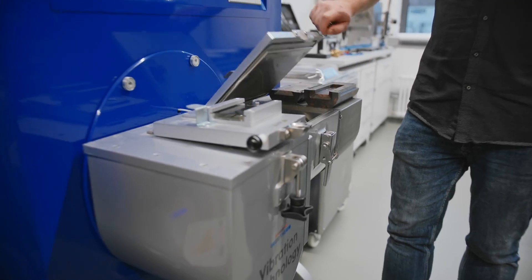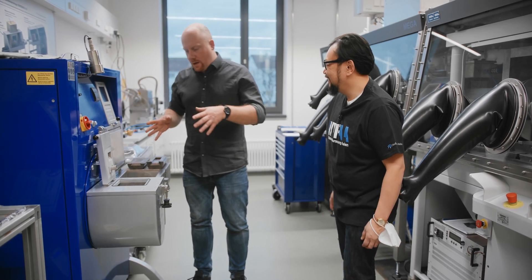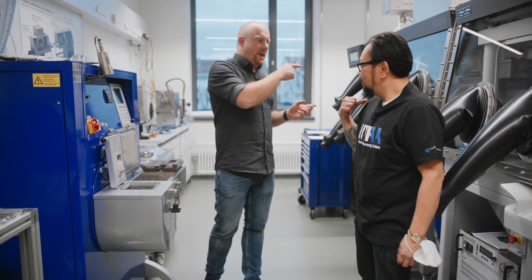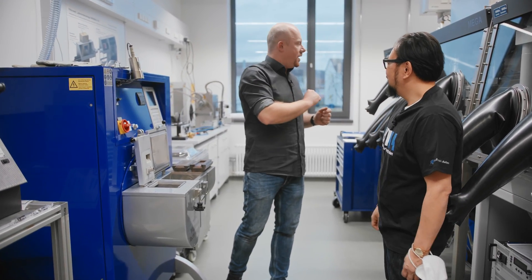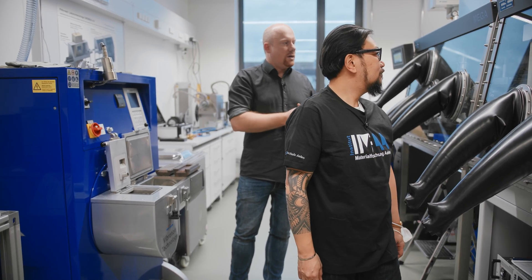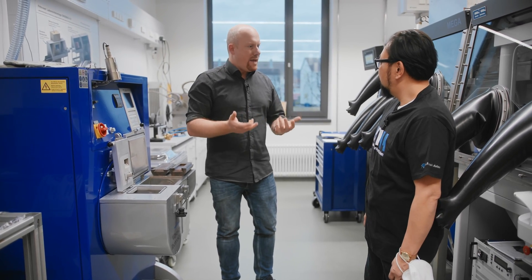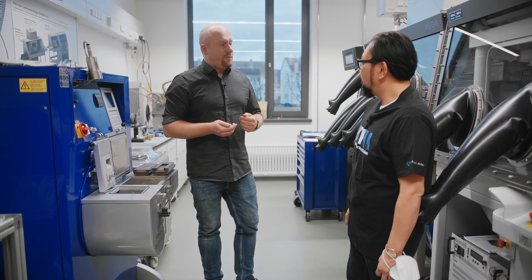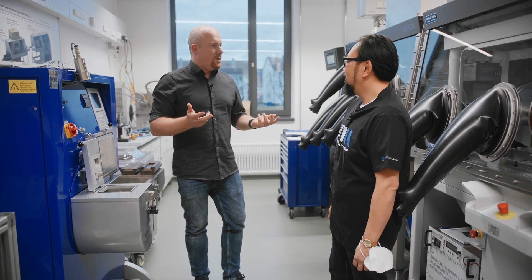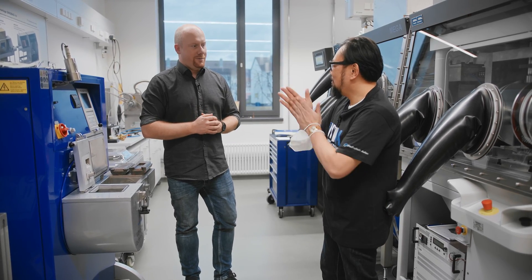Here we are in the magnetic manufacturing lab, where we make our own magnets — experimental alloys. We first melt all the alloys here, and as they are very sensitive to oxygen, we transfer them to a glove box system. We do the milling to get a powder, and as normal magnets are powder metallurgy products, we then press them in a strong magnetic field and do the sintering process — basically baking the magnets. When they are finished sintering, they are magnets, and of course magnets have to be measured magnetically, which is done in the basement. Let's go there now.